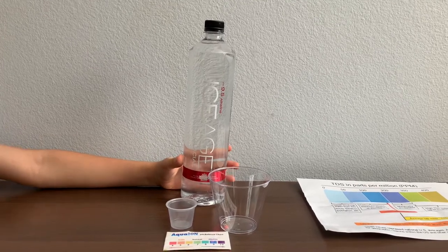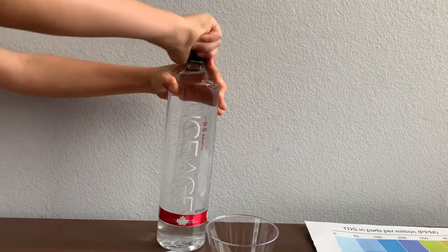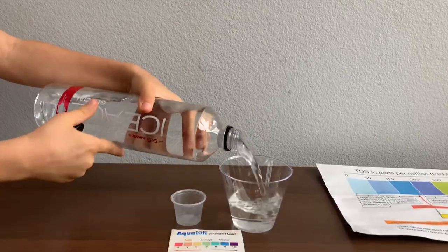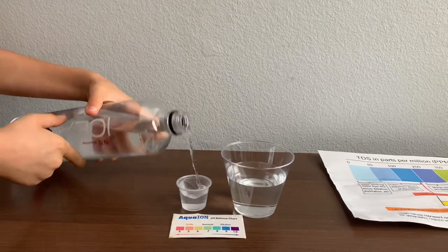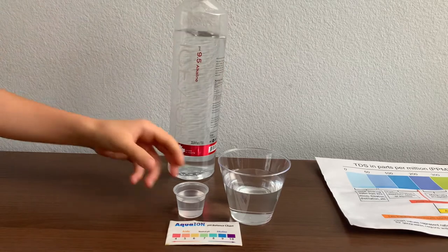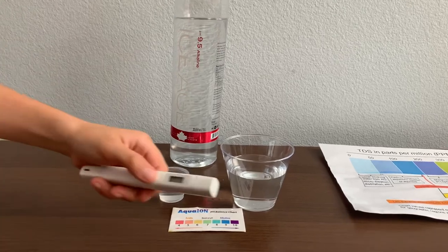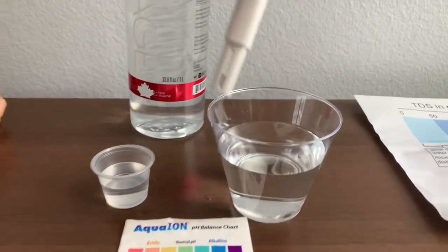Let's test the pH and TDS levels. Let's pour some water in. This is a little too much for the pH cup, so let's pour some back into the TDS. First, we're going to test the TDS level. Turn on the TDS tester, make sure it says 0, and put it in.